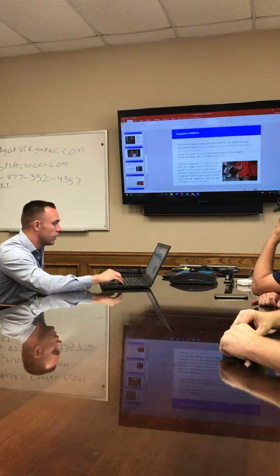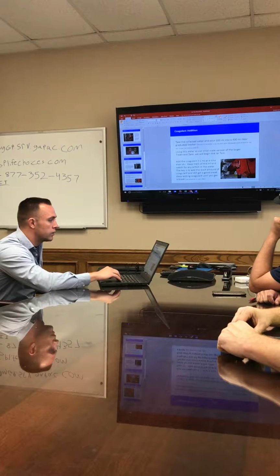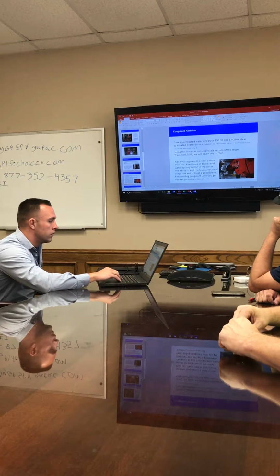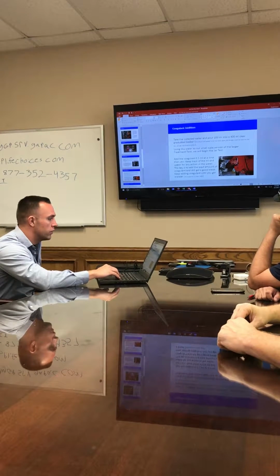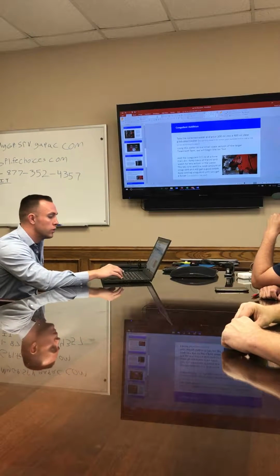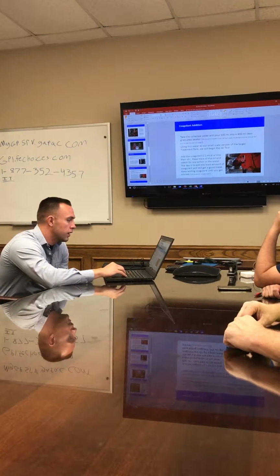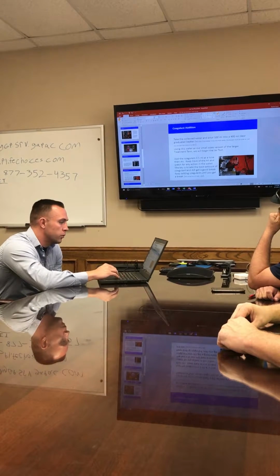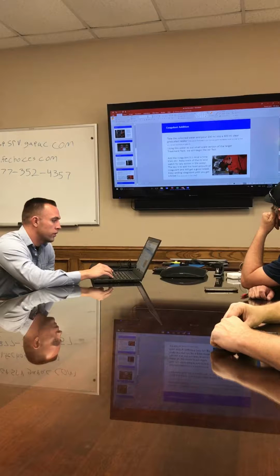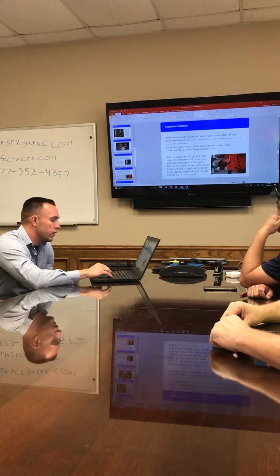Okay, the first step is your coagulant addition. Take the collected water and pour a 100 milliliter sample into a 400 milliliter clear graduated beaker. Using this water as our small scale version of the larger treatment tank, we will begin the jar test. And we'll go through that once the PowerPoint's over. Add your coagulant, 0.1 milliliter at a time, and then stir. Keep track of your milliliters and watch for any action in the water. The key is to add the least amount of chemical and still get a good break. Keep adding the coagulant until you get a good break.